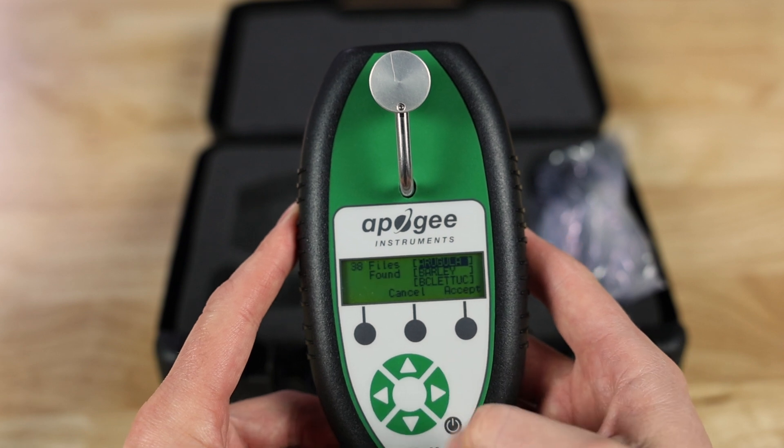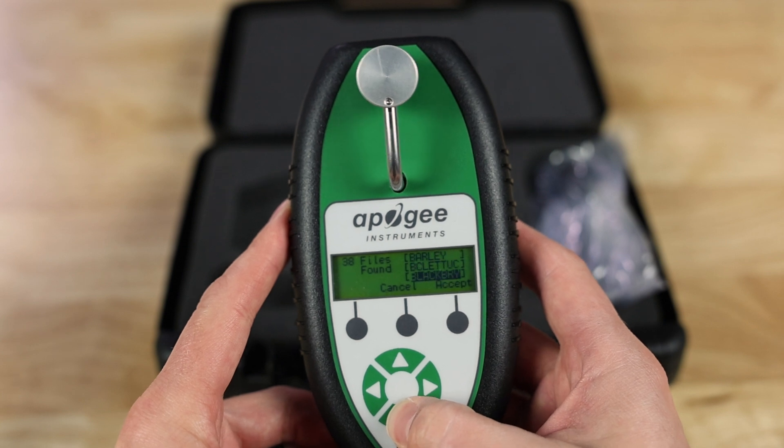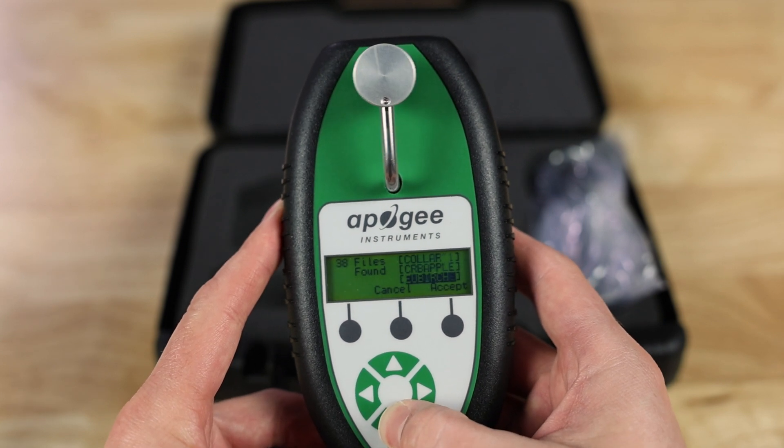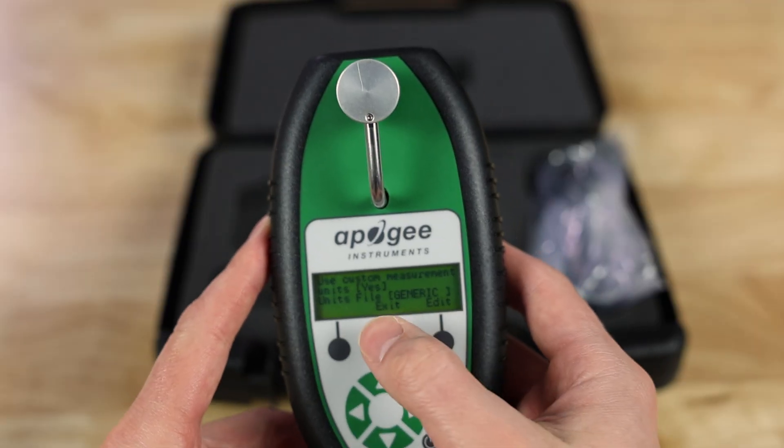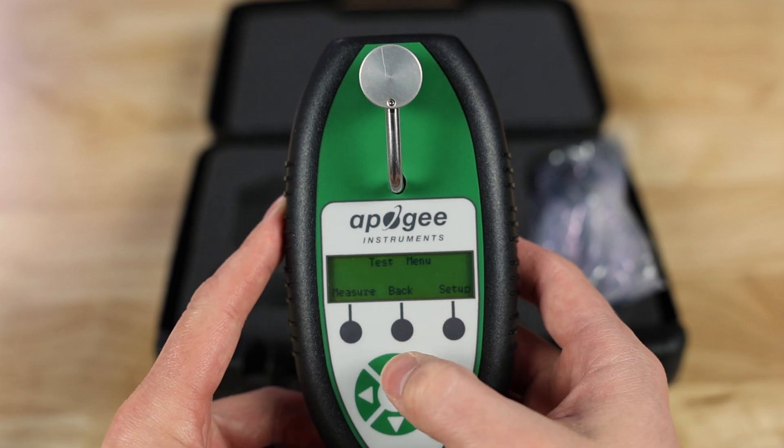With Yes highlighted, press the right arrow button and it'll give you a list of all the different species available — here's the full list as of January 2025, in alphabetical order. Find the one you're looking for; if you don't see the exact species, find the closest one. If you still don't see it, there is a generic curve available that works with most species. We're going to select Generic because this specific plant isn't on the list, then hit Accept. It'll show the unit file saying Generic below, meaning you're ready to start testing — hit Exit and then push the Measure button.